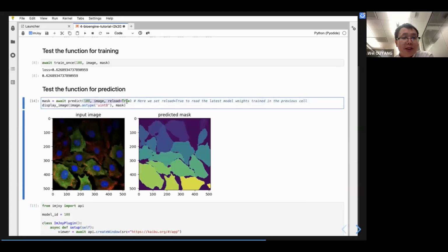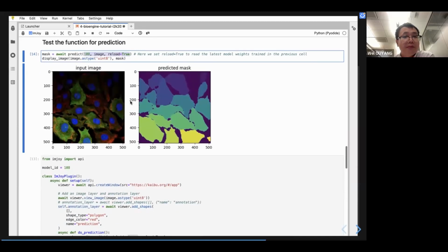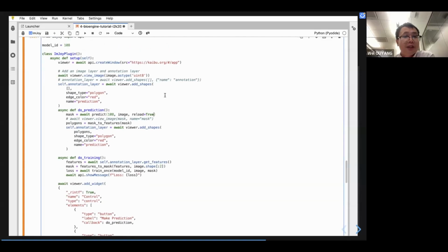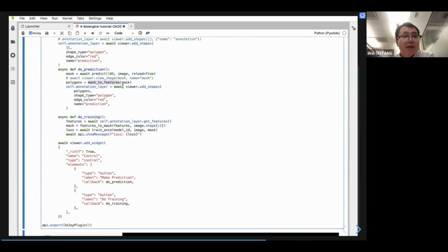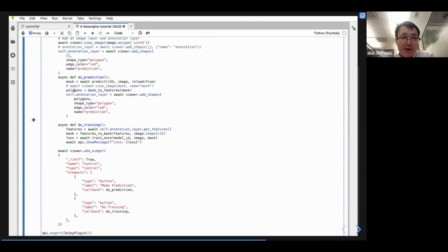Predict 108 reload, and then we have the ask. Let me do another quick try and see if it works. So there's something wrong. Okay, for the sake of time, I'm going to leave this part.